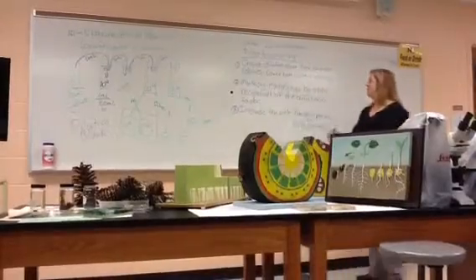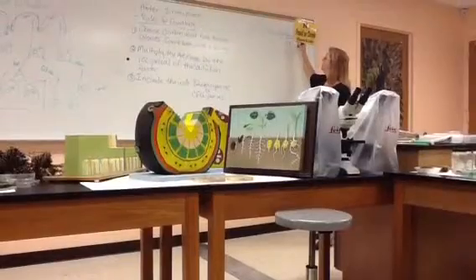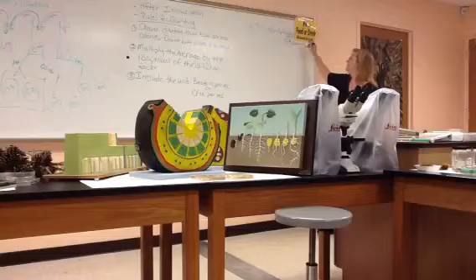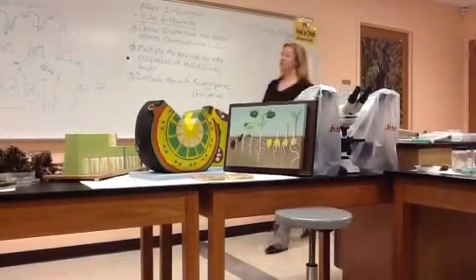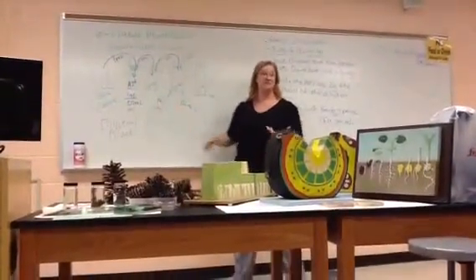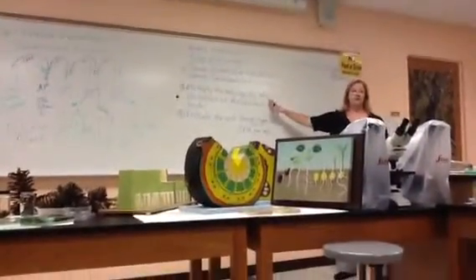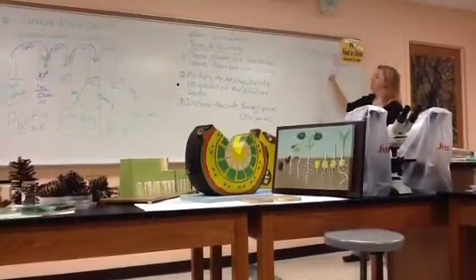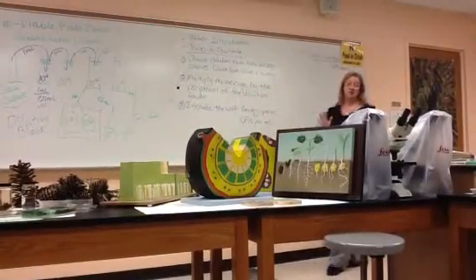So when you actually do that count, that tells you how many bacteria were in the 10 to the minus 6 dilution per ml. You've got to follow that? Because you pipetted a ml of liquid from the 10 to the minus 6 dilution, there were 167 bacteria in that ml. So to work the math backwards, to figure out how many were in the stock culture, you're going to take that average and multiply it by the reciprocal of the dilution factor. Sounds worse than it is.